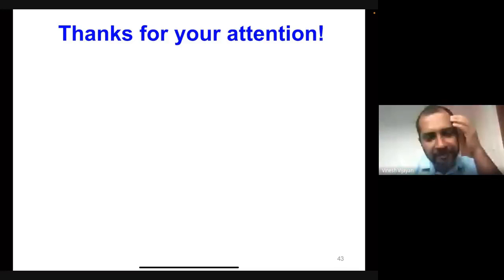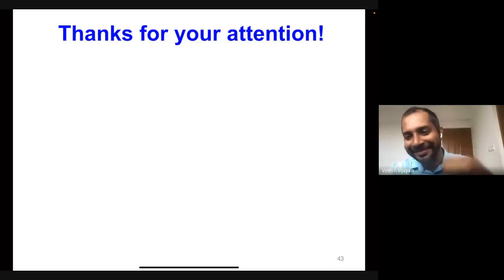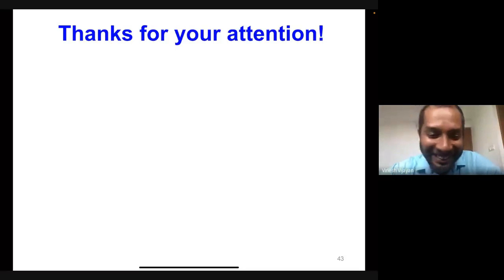And I see a couple of comments that are coming. Thank you for all your good comments, Asha, Shabuddin, and Bharati. And I see that Anju is asking, in single crystal XRD, I get a new structure with around 30 carbons. But in NMR, I got around 60 peaks. So that is double the number of carbon atoms, suggesting two or more compounds together. But XRD gives a single structure. Why does this happen? In solution state, does the compound isomerize?